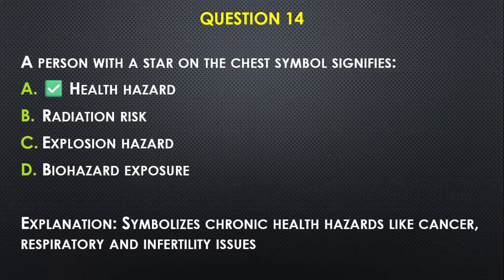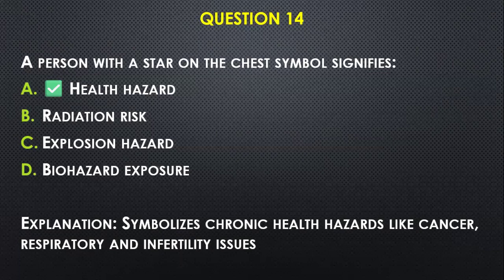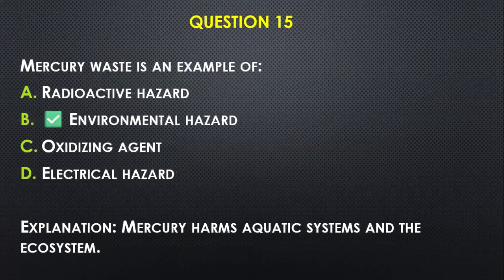Question number fourteen: A person with a star on the chest symbol signifies — A) health hazard, B) radiation, C) explosion hazard, D) biohazard exposure. We go with A, because that represents chronic health hazards like cancer, respiratory, and fertility issues. The skull and crossbones represents acute toxicity, while the person with a star on the chest signifies chronic health hazards.